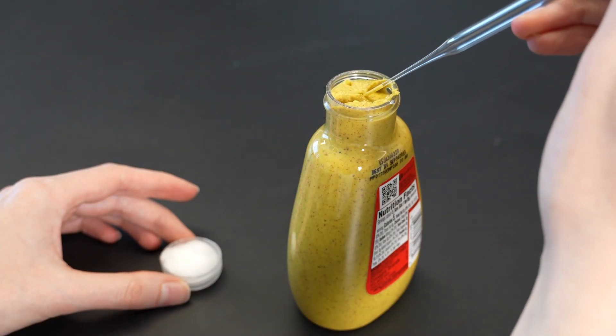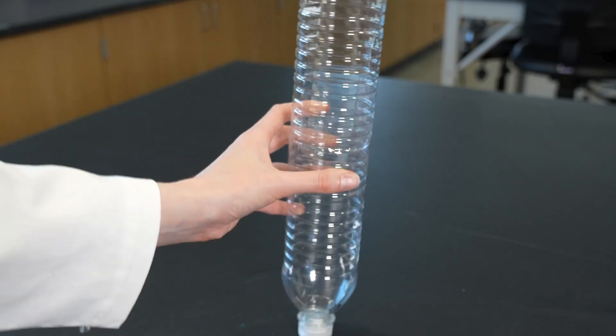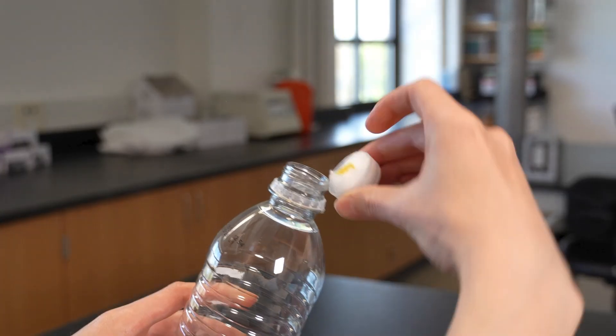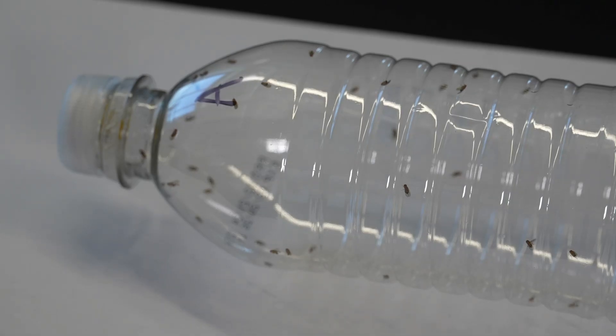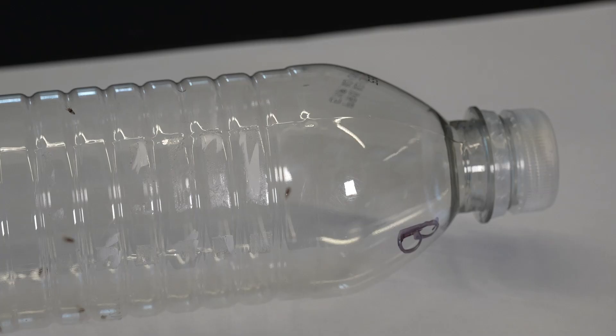Now we want to see if the flies exhibit chemotaxis when exposed to a household substance. We'll do all of our experimental data collection in comparison to distilled water, so we'll keep the distilled water cap on side B and swap out side A for various chemical stimuli. When choosing substances to test, think about where you've observed fruit flies before — what might be attracting them and what might keep them away? I'm going to try mustard, because I've definitely seen fruit flies get way too interested in my picnic sandwiches. I'll add a few drops of mustard to a fresh cotton ball on a fresh cap, tap the flies down in the chamber, and quickly swap out the distilled water cap on side A for the new mustard cap. After five minutes, I record my results: 52 flies on mustard side A and 8 on distilled water side B.